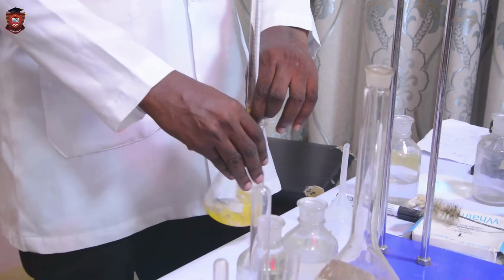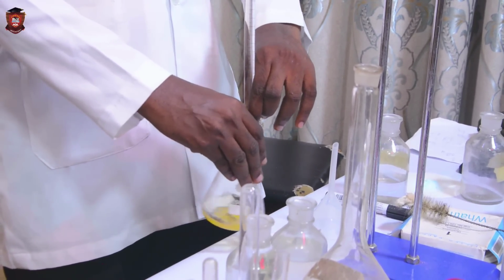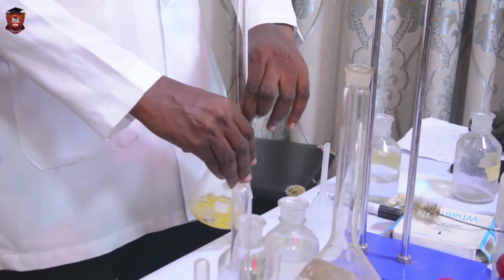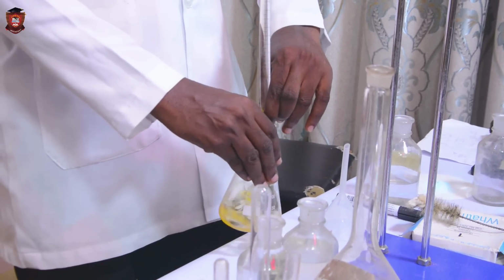The reason why you are swinging or shaking it is to make sure that the color is homogeneous. It's not the case where the purple is only at the middle. So shaking will help to obtain homogeneity in the mixture. So that's the essence of this shaking.